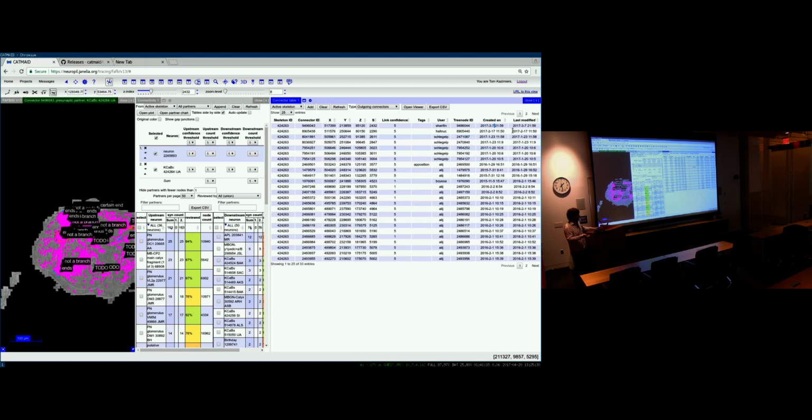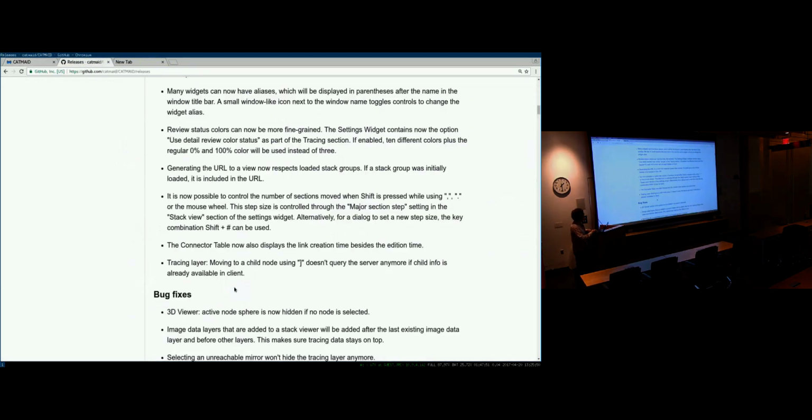Right, with the numbers 1 to 5, you can apply confidence values to nodes or to edges actually between nodes, or at least that's how it is visualized. And the same is true for this connection between connectors and the node. And this would cause a change in the modification date, but obviously not in the creation date. Both seem to be useful, so both are visible there.